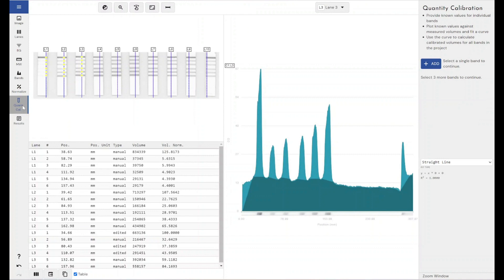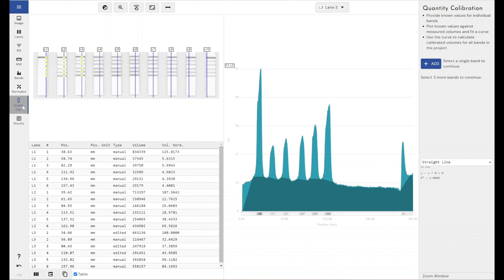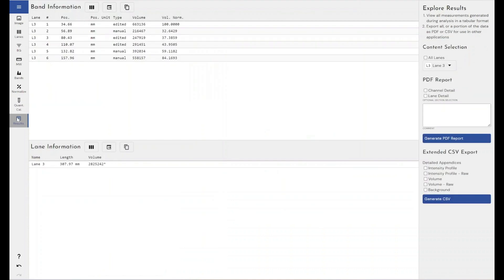Quantity calibration, again, not hugely useful in your typical lateral flow setup, but would allow you to generate a standard curve from three or more bands within your experiment. If those were of a known mass, volume, and any known kind of quantity, then you could build up your concentration curve from that and then express your results as mass, concentration, something like that. And then we come through to the results section.